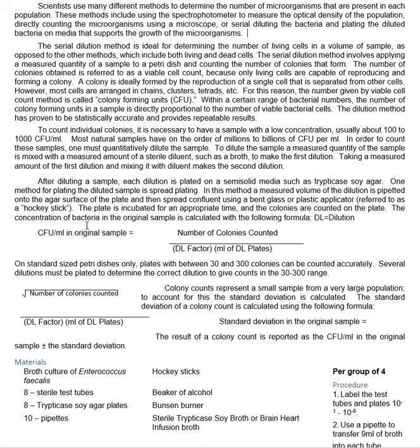So if I have 9 milliliters of fluid in a test tube and I add 1 milliliter of bacteria, then I have 10 milliliters total. And of that 10 milliliters, 1 out of those 10 is bacteria. Does that make sense to you guys? It's 1/10. Mathematically, you can express 1/10 as 1 times 10 to the minus 1.